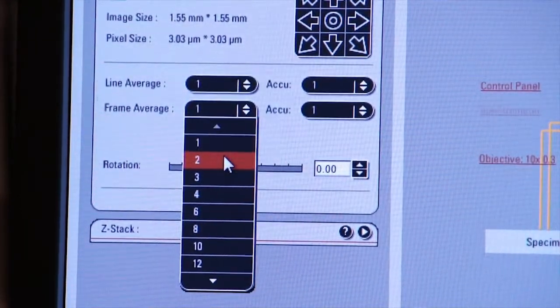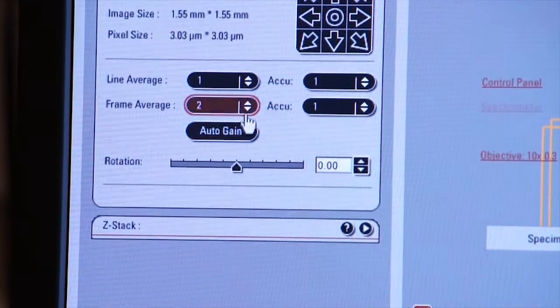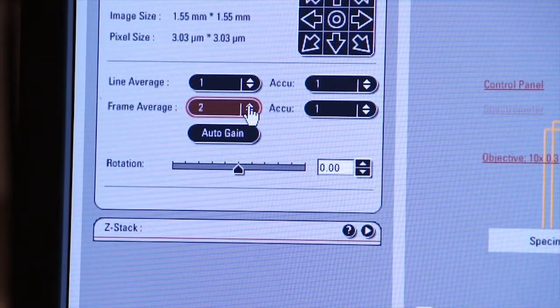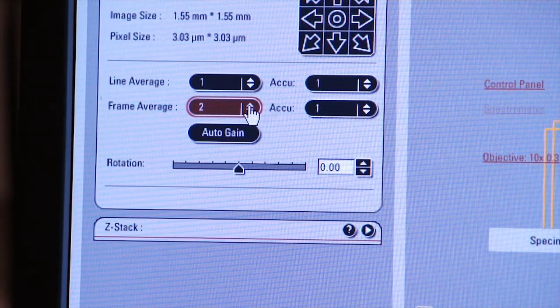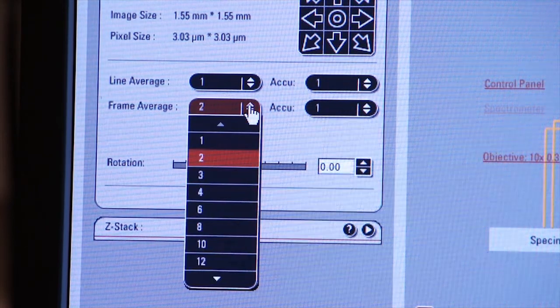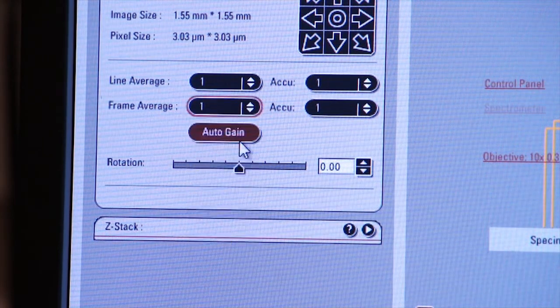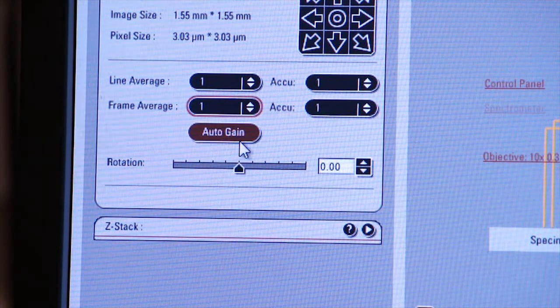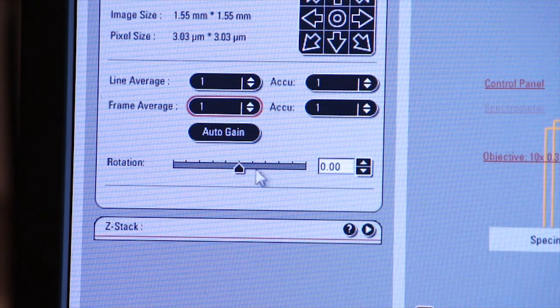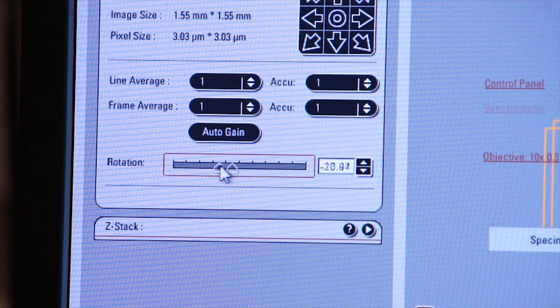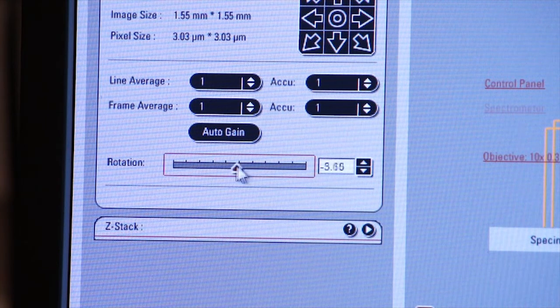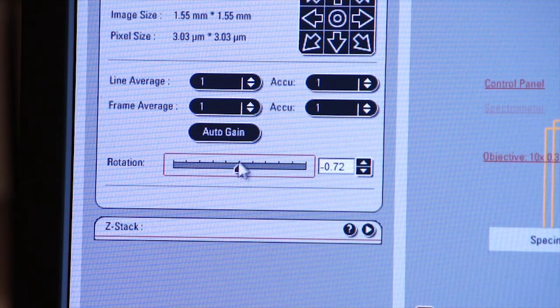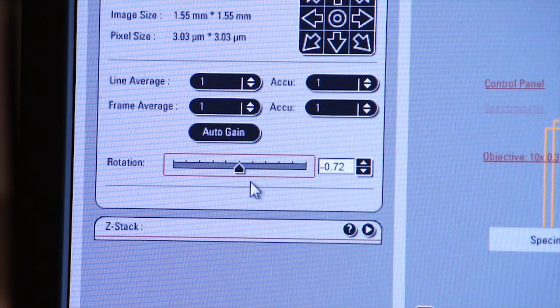But again, the more frames that you scan per image, the slower the system will become, and the more you run the risk of photo bleaching your specimen. So we'll leave it at one for now. This final tab allows you to rotate your image around a point in the center. But normally, we'll just leave that centered at the center point of the travel.